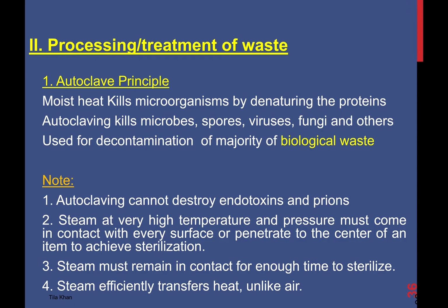So it must be loosely tied, and steam must remain in contact for enough time to sterilize. Unlike dry heat sterilization, steam is more efficient in transferring heat, so autoclaving is the more preferred method for decontamination or processing of waste.